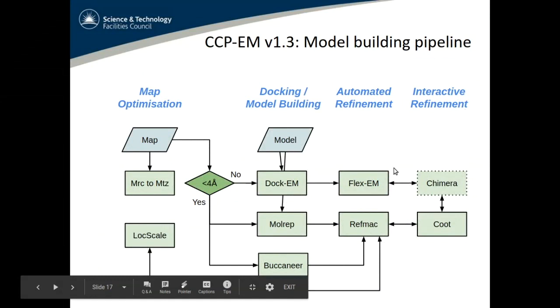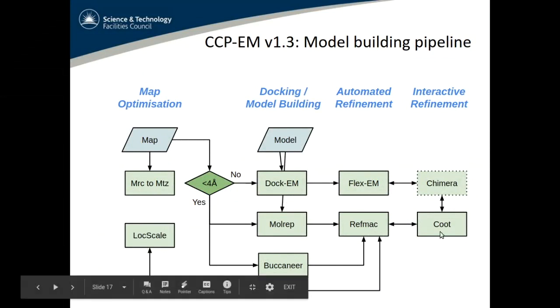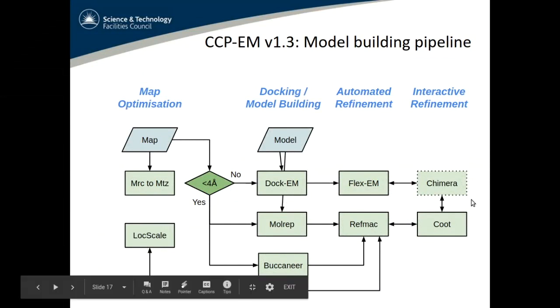And then you probably also need to tidy up your model, do interactive refinements, as when you're editing the model by hand or looking at it, checking where the good bits are, where the bad bits are. And for that, we supply a copy of Coot, the latest, greatest cryo-EM version. And we also interact nicely with Chimera, but we don't have our own copy.